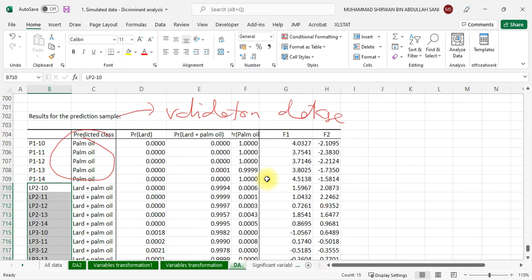Matrix issues, because in actual samples there are a lot of ingredients being added. Sometimes we have preservatives, and sometimes in the sample we have bacteria that ferment, and they also have their own fatty acids. So if you can explain the potential contributors to uncertainties like this, at least people will take note of why.